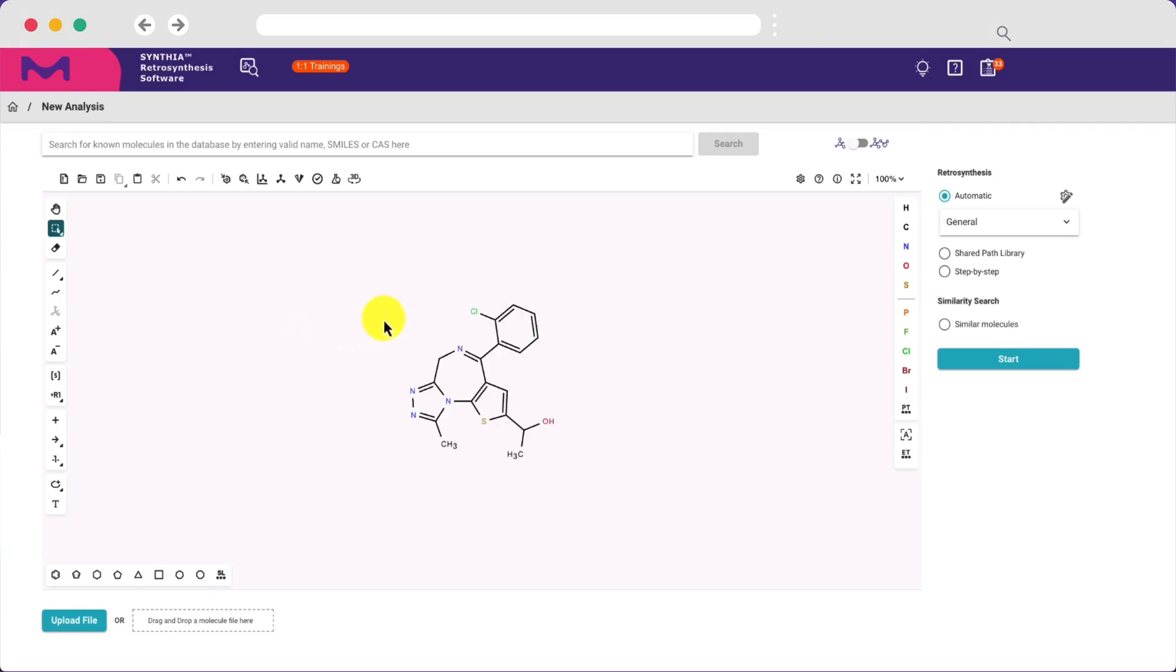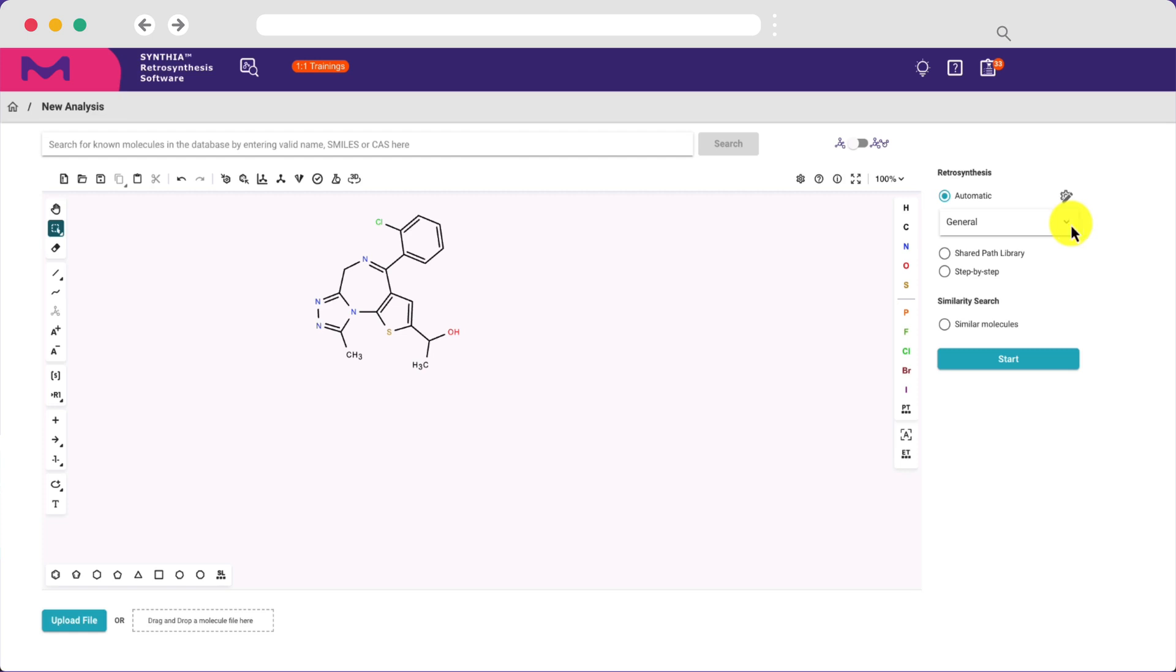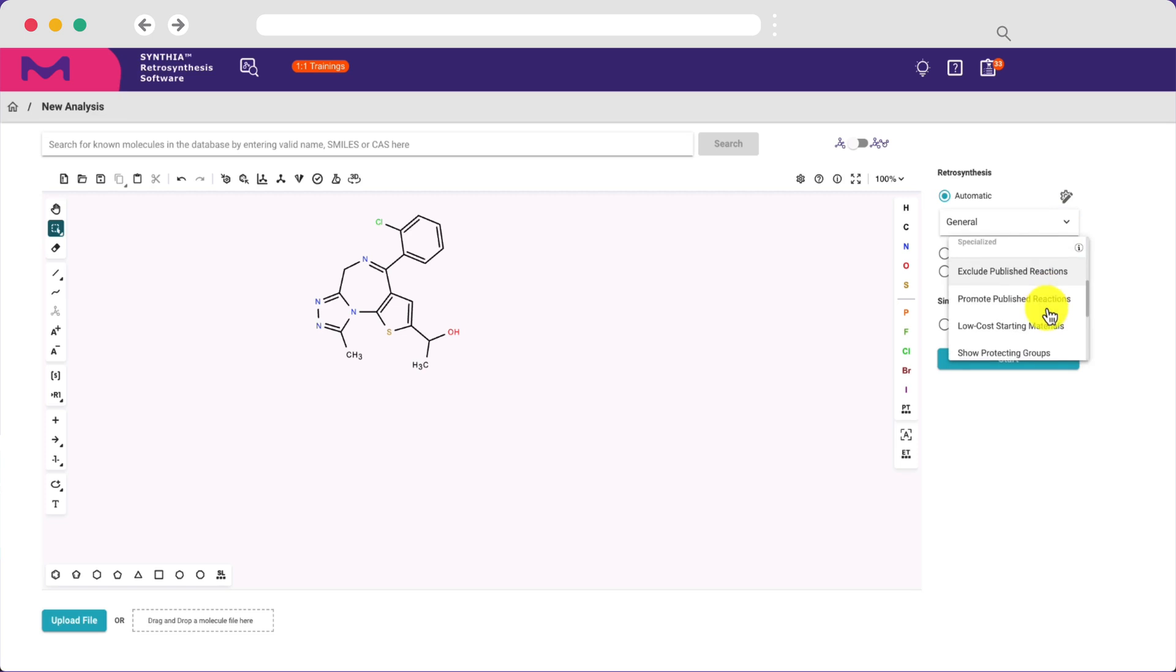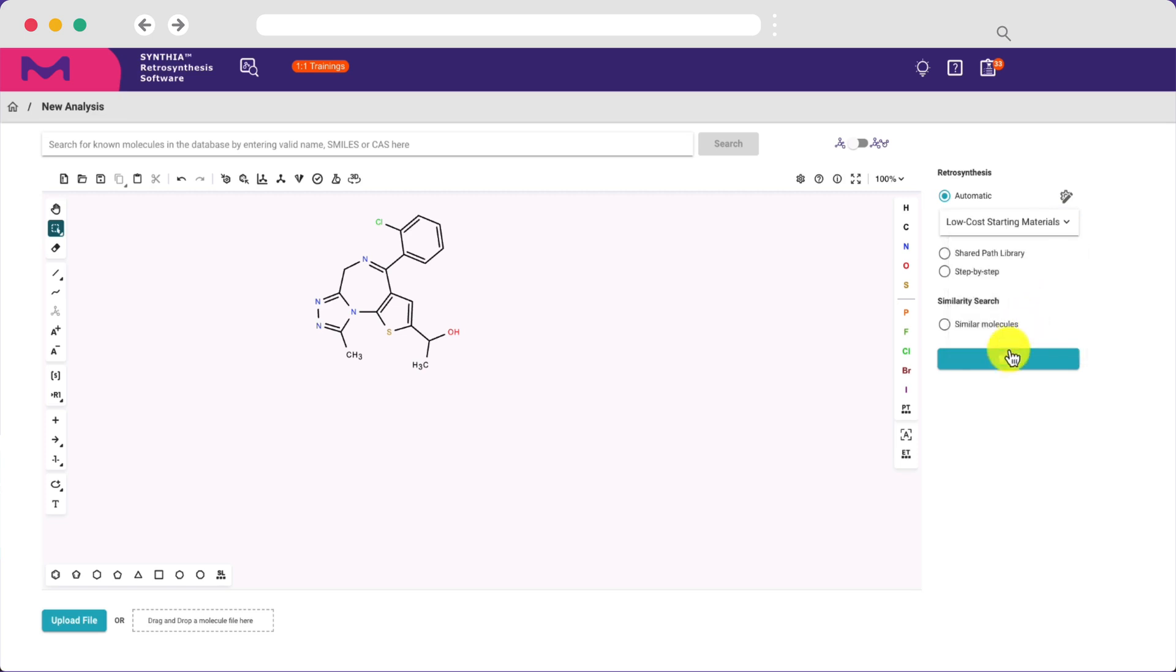Once you've input your target molecule and desired constraints, Cynthia delivers precise pathways that take stereochemistry and functional group incompatibilities into account.